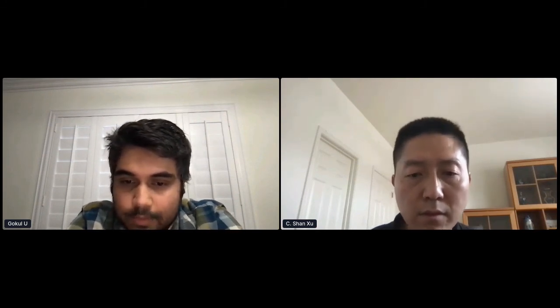Perfect. I have a few questions from the audience members here. I think William, Sean just probably answered your question about these enhancements making their way to the commercial systems. Hannah's asking about how do you segment different organelles, but I'm assuming we're going to hear a lot about that from Aubrey. But Sean, if you have more comments, please feel free to add to that.